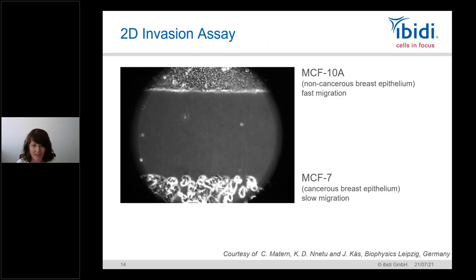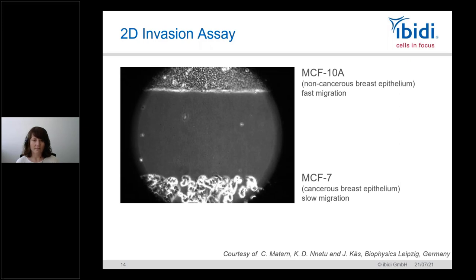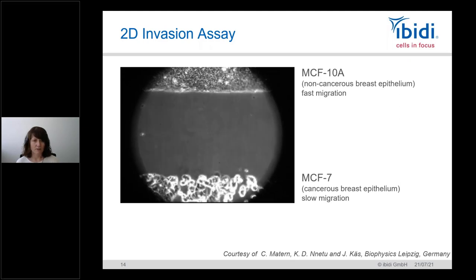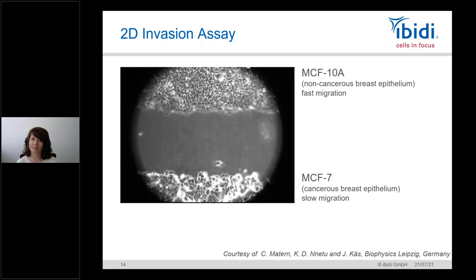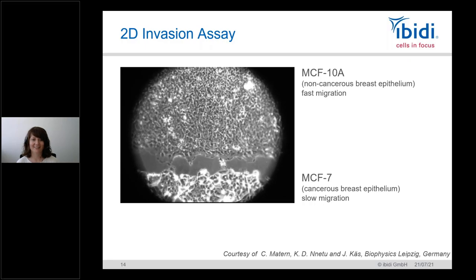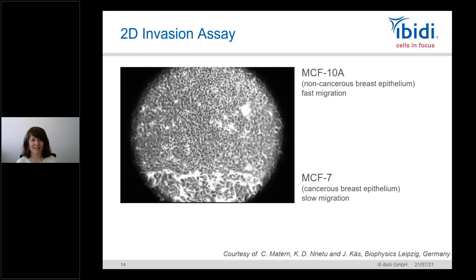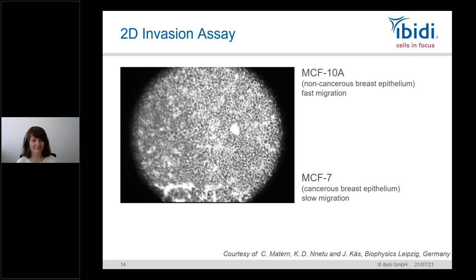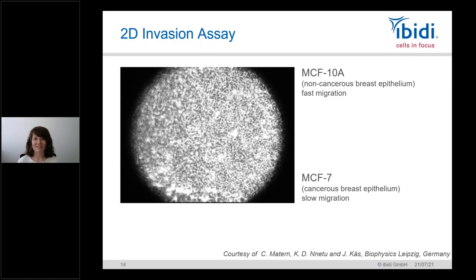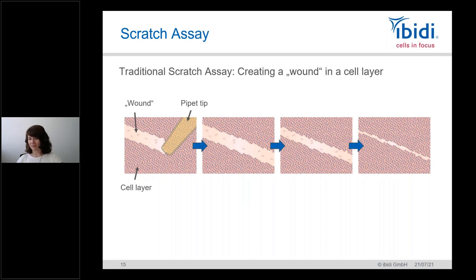You can also run a 2D invasion assay by placing different cell types into the two wells. For example, we show MCF-10 and MCF-7 cell lines migrating after the gap is opened — one is clearly much faster than the other, and it looks quite like an invasion. Having two separate wells lets you study interactions between different cell types.